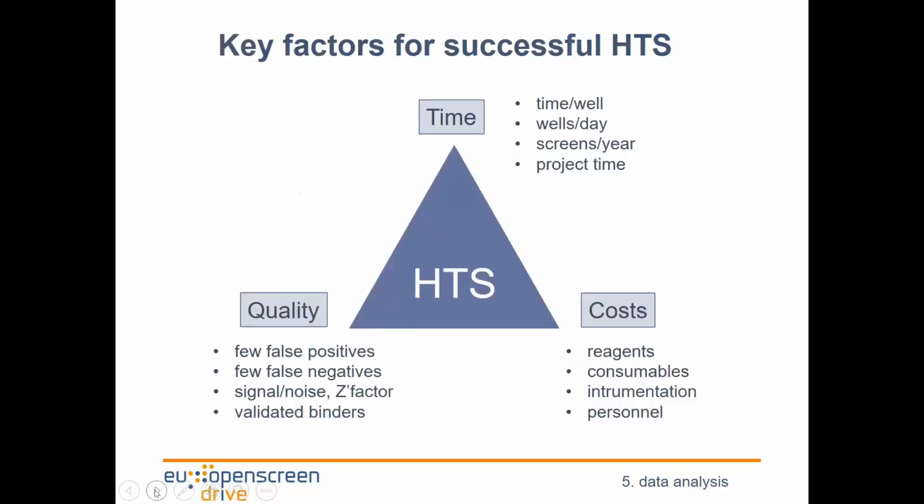This is my final slide before we pass to the next step of the course. In this slide, I would like to summarize more or less the key factors for the success of HTS. There are three main topics that we mentioned throughout the HTS course. One is quality. It's very important to maintain the quality of the HTS process. It's also very important to take time into account.